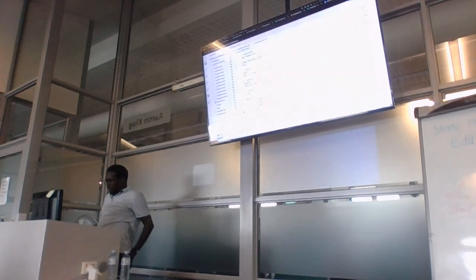Yeah, it's still not working because I need to incorporate a configuration file.